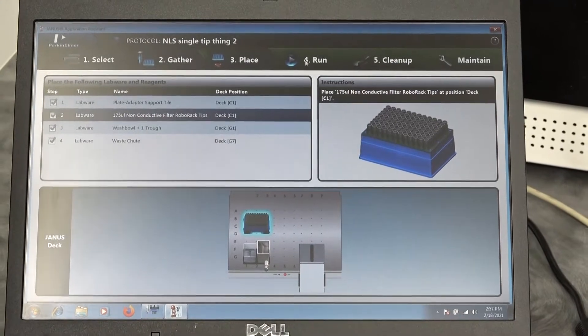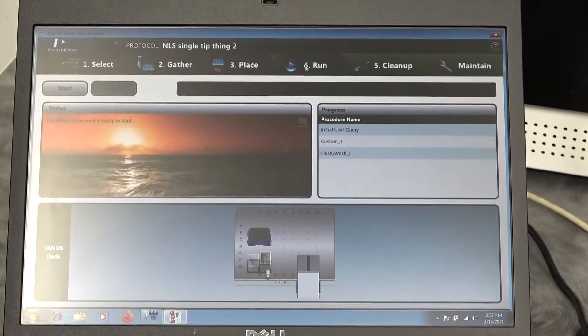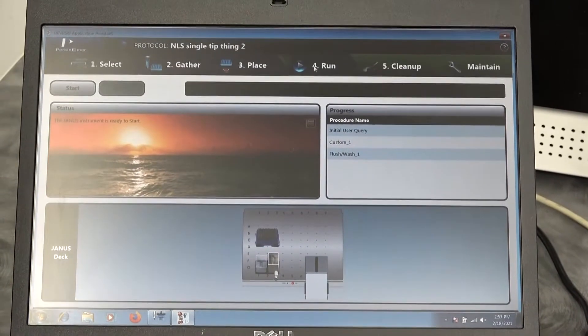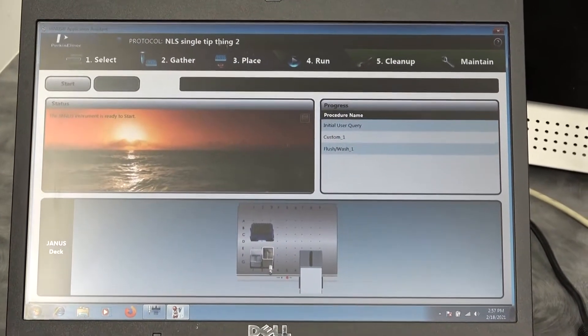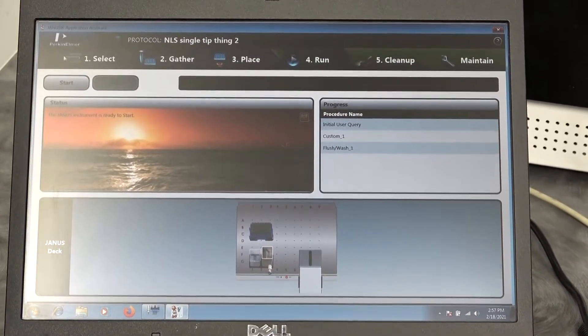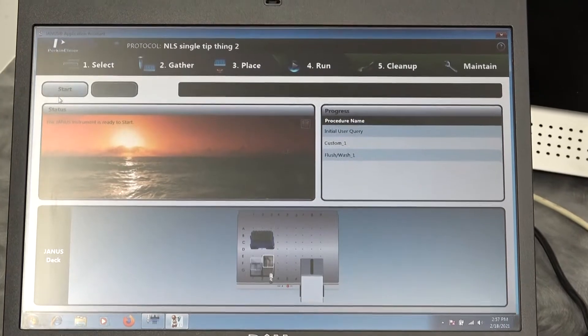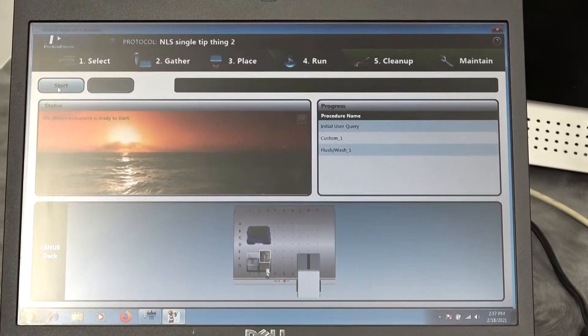When we select run, it comes up with the default menu and tells you, okay, I'm ready to start this menu.